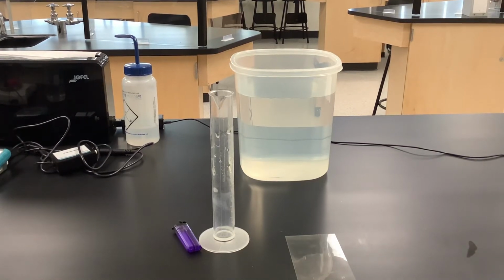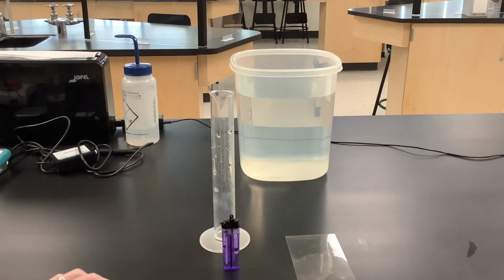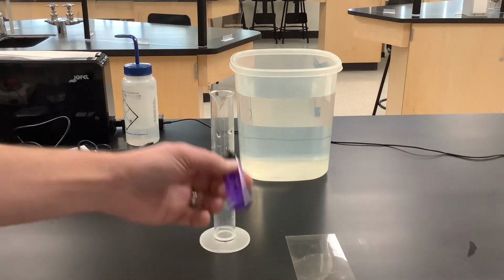Okay guys, here we go. Today the goal is to try and find the molar mass of butane. So butane is the chemical that we find inside of cigarette lighters.